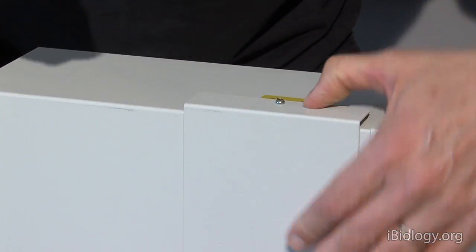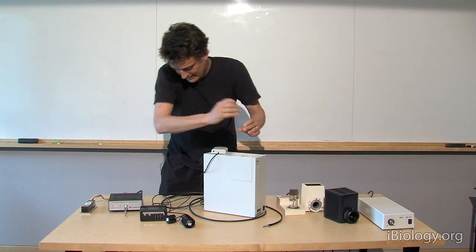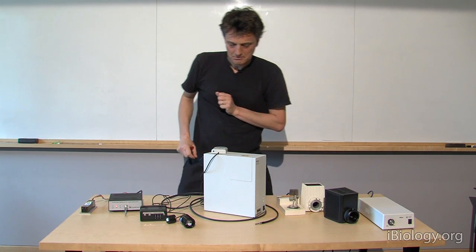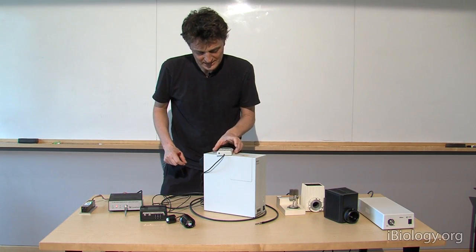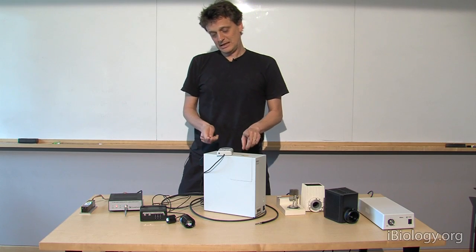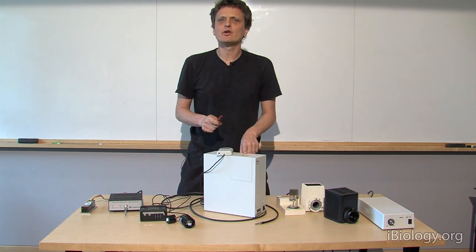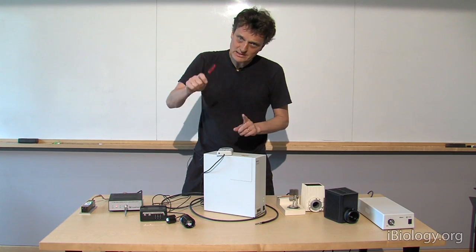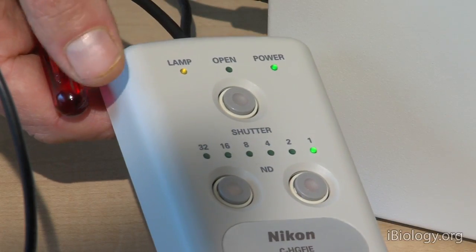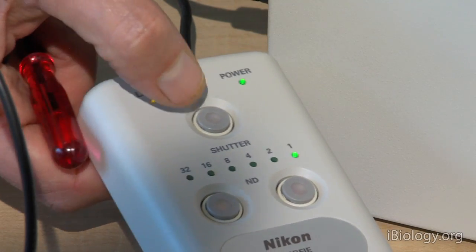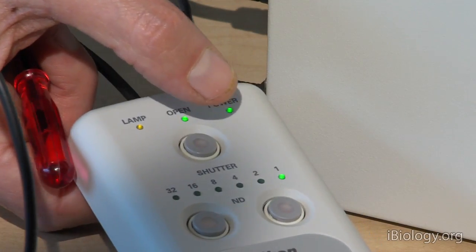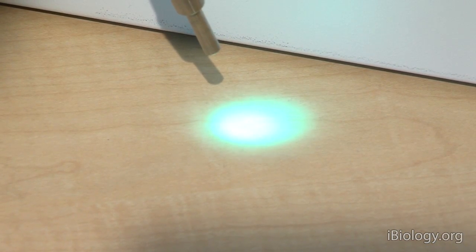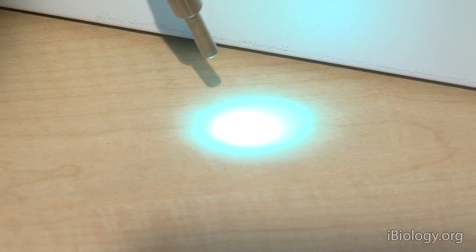The light is coupled in on this end and then makes it all the way to the end. When I now assemble this and fire it up here, it makes a lot of noise and takes some time. One thing about these lamps is that they don't like to be switched on and off very often. Once they are on, leave them on for at least an hour or so. When I now press the shutter so that it opens, you see the light coming out of this liquid light guide. The lamp needs to warm up a bit and it will become brighter and brighter over time.